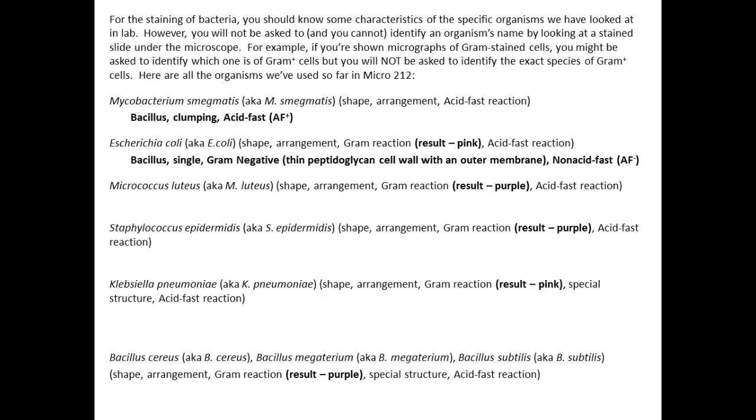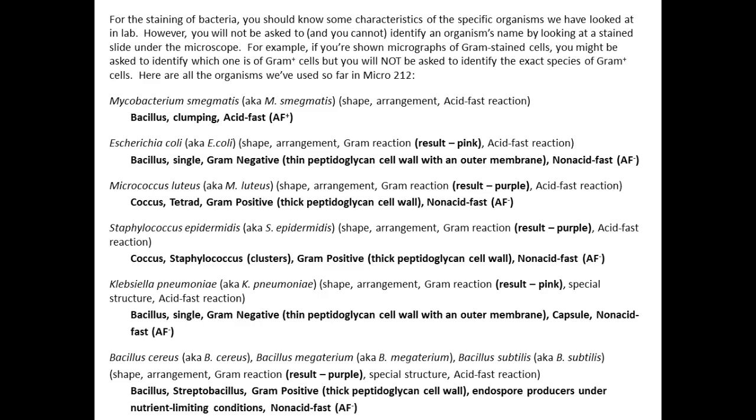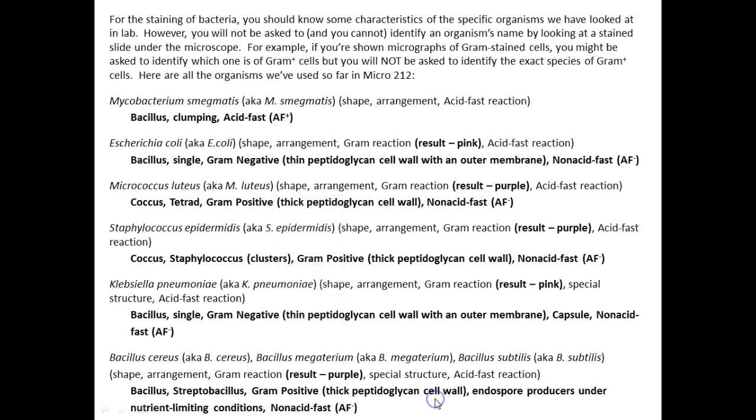So the other thing is, remember, with the gram-negatives, it's that thin cell wall made out of peptidoglycan, if they have it at all, and they have that outer membrane, which is why they're going to be negative. So that was the only thing. I think that's the last slide. At least it should be.